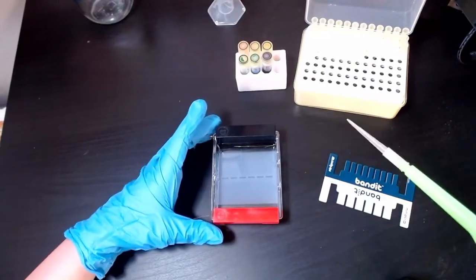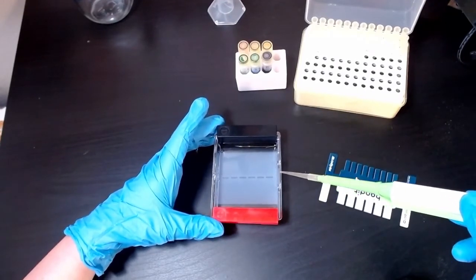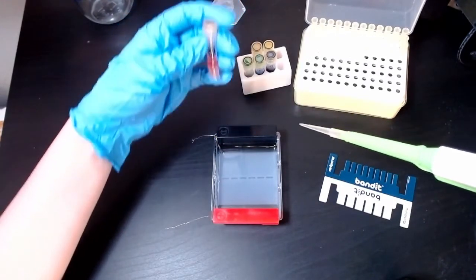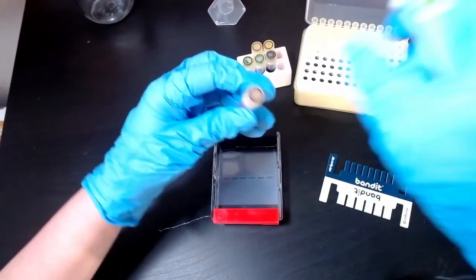And if you're familiar with gel electrophoresis, you might notice that it's a little unusual that the wells in our gel are in the middle. We're going to talk all about that in just a minute. But the first thing that I want to do is load these dyes into this gel. And we're going to do it in our rainbow order.